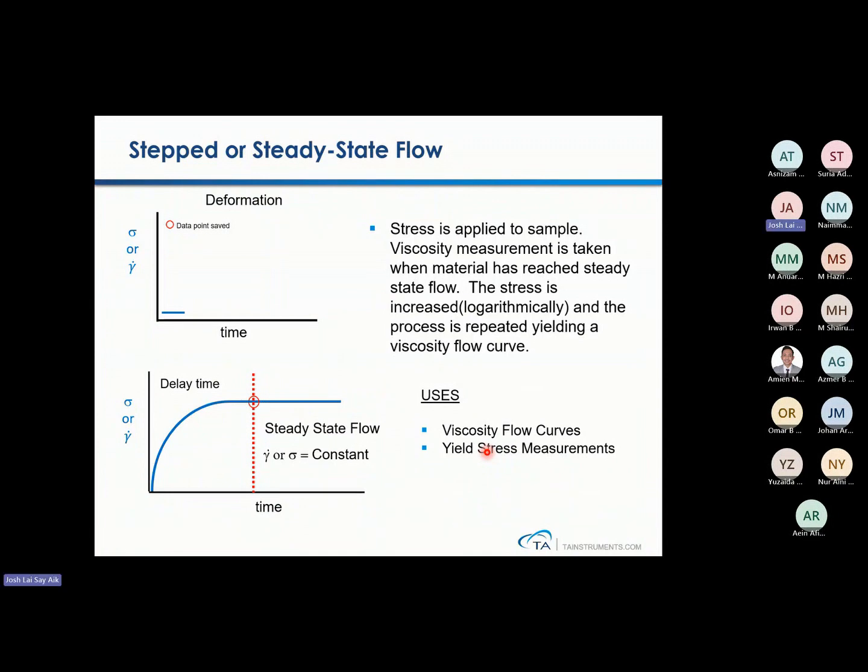So typically you have a short period of time, and then they're going to collect at the end of the first shear rate, followed by the second one, and hold for, let's say, 3 seconds. This soak time here, the user needs to define how long it will take to reach steady state. Maybe 10 seconds, 30 seconds, or even 60 seconds.